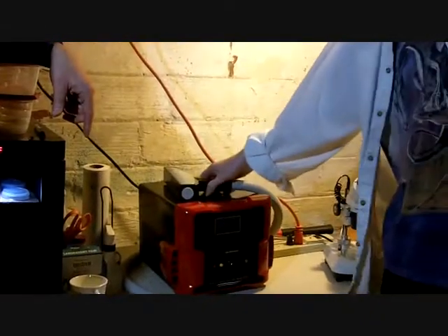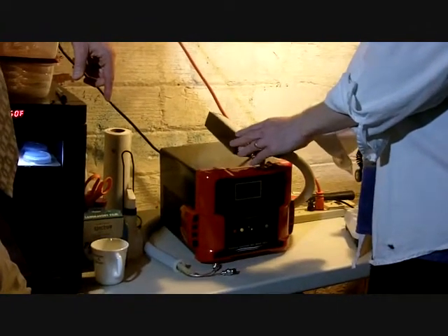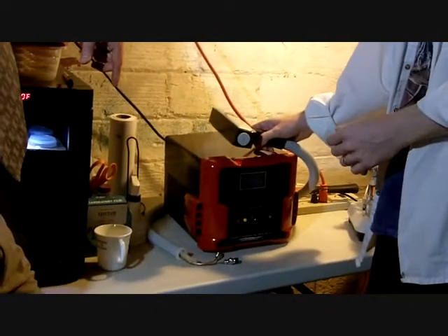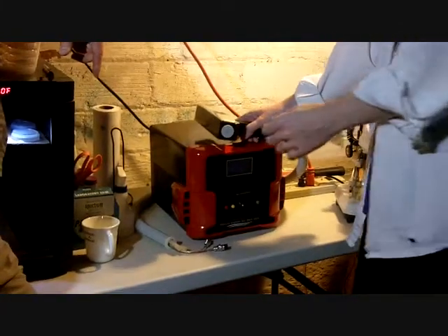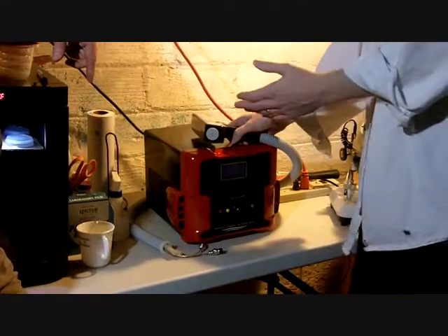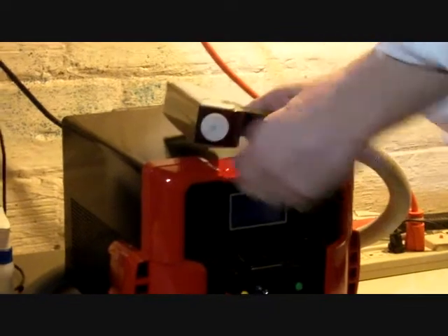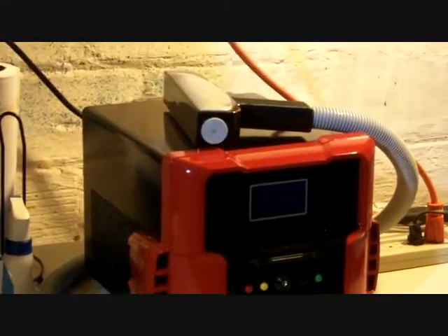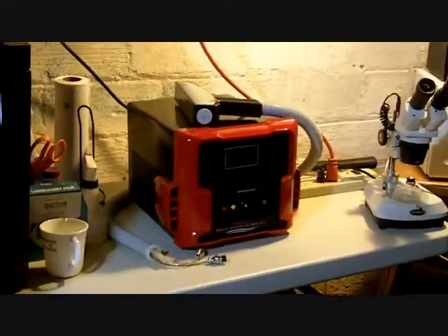Well, the laser has 2 different wavelengths. It's coming straight out of the device as infrared, 1064 nanometers, and it's got a small optics device I left in the case there that will basically double the frequency, halving the wavelength, so that'll give it a 532 nanometer green color, and we'll be using both of those to treat the worms. The green is pretty harsh because it's very effective at removing pigments, but I think that's going to be useful.